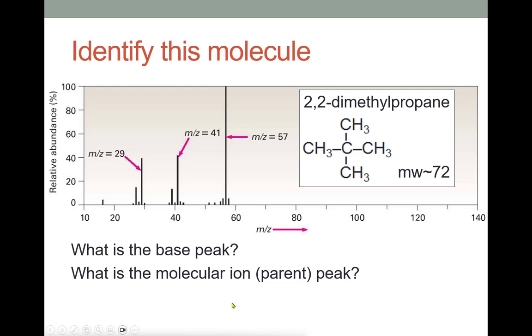As we go forward here, here's an example, and I'm giving you the answer. This is a particular molecule here. We can see 5 carbons with the accompanying hydrogens, a highly branched alkane. In this case, I've calculated molecular weight should be 72, but we obviously don't see a 72 peak. Why is that?